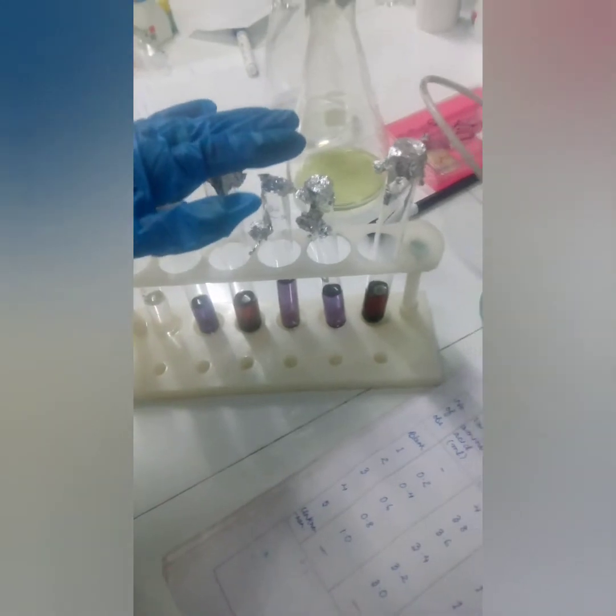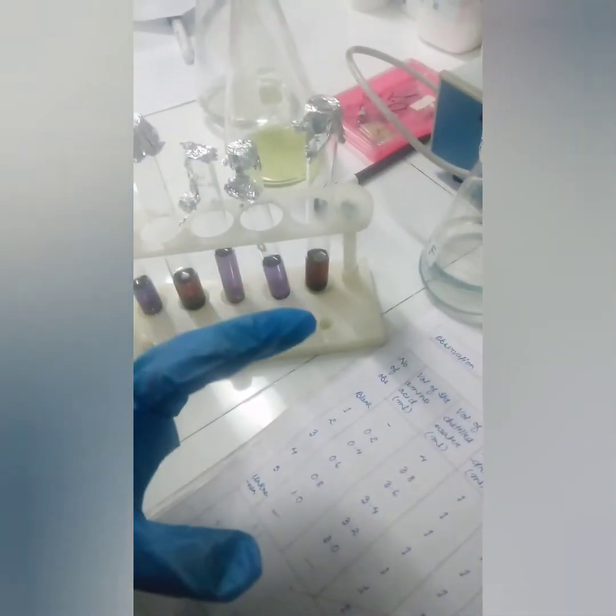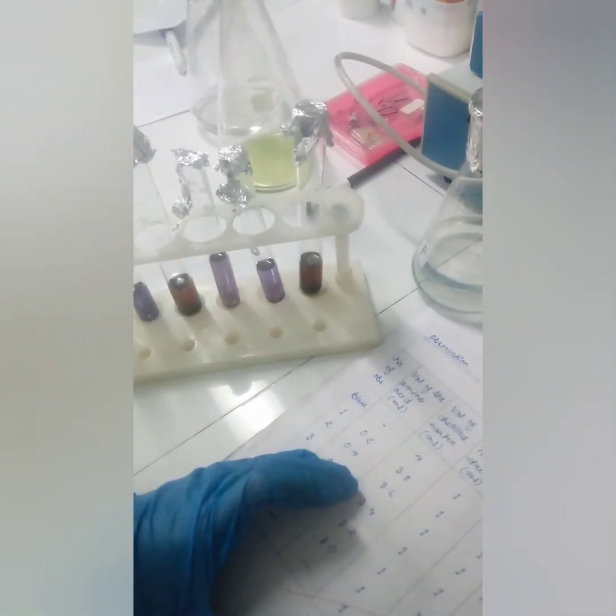After taking out these test tubes from the water bath, you will let them cool down, or you will keep them inside cold water. And after that, the last step, as I said, is we will add ethanol in order to stop the reaction. So now we will take the absorbance reading.